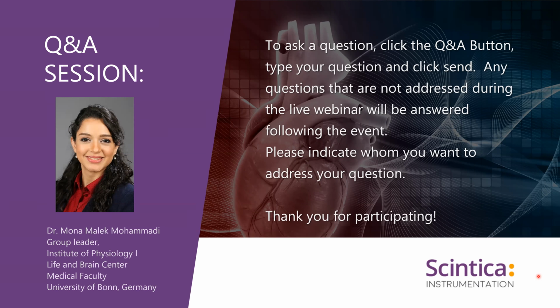This rate of cannibalism might be different in different strains. So for this reason, I cannot give any percentage for cannibalism, but you can reduce it with the things that I mentioned, for example, using CD1 or taking care of the pups or generating less stress. And this can really be reduced to 0%. Well, that's great to hear.